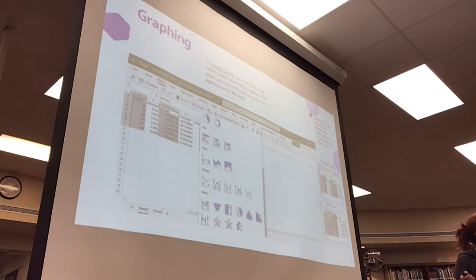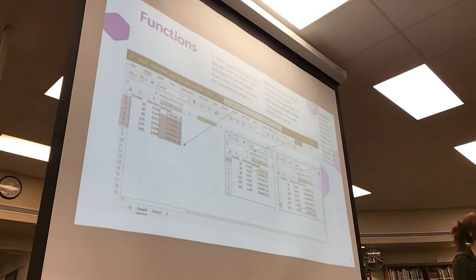Is there a way to not do that? Instead of having it copy the formatting and transpose it, is there a way to keep that one function and put that exact same function with all the exact same cells into another one? So this says B2 divided by 1.4 times 10 to the 7th. You want that to just be into another one that doesn't use any other cell's data, those exact same cells. Would it be copy paste? Basically, you can hit the format, okay.